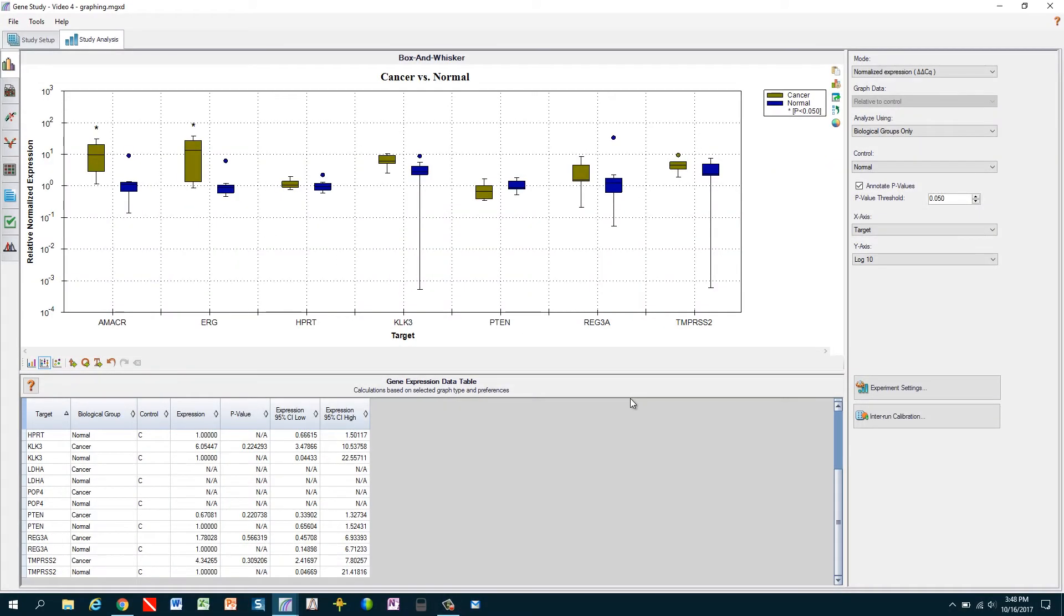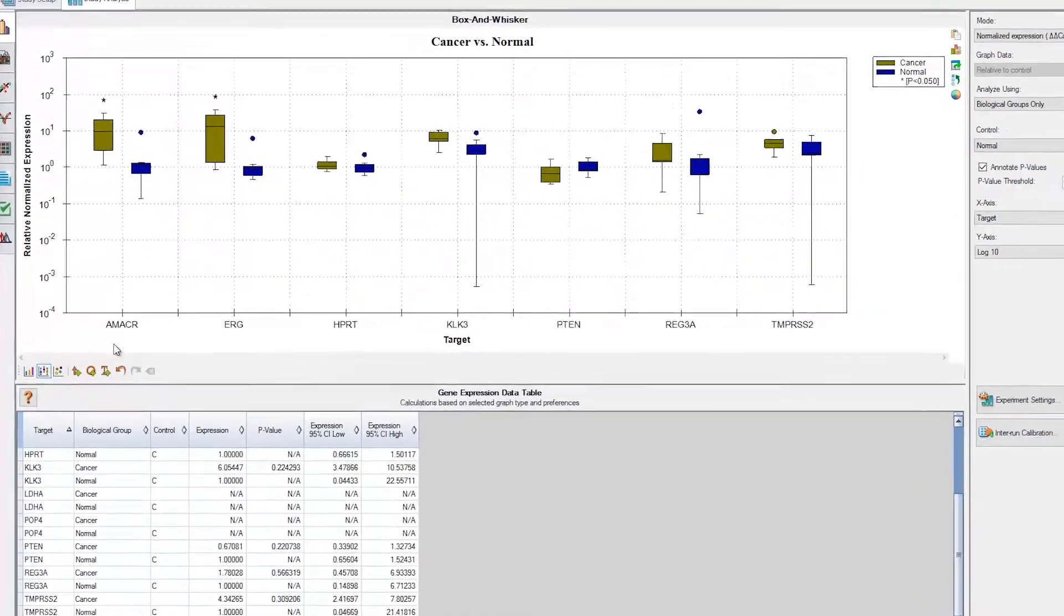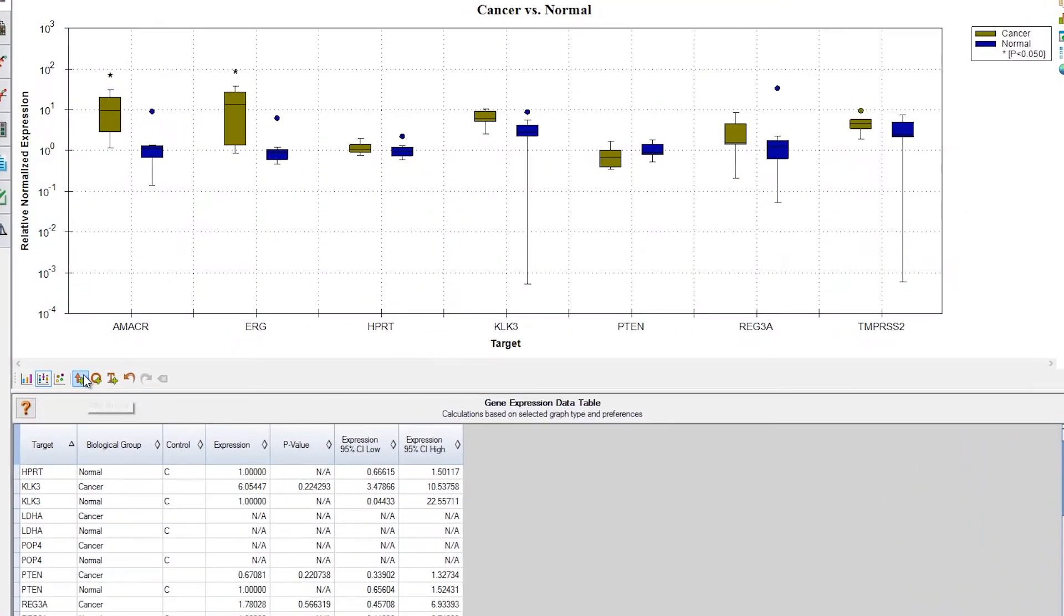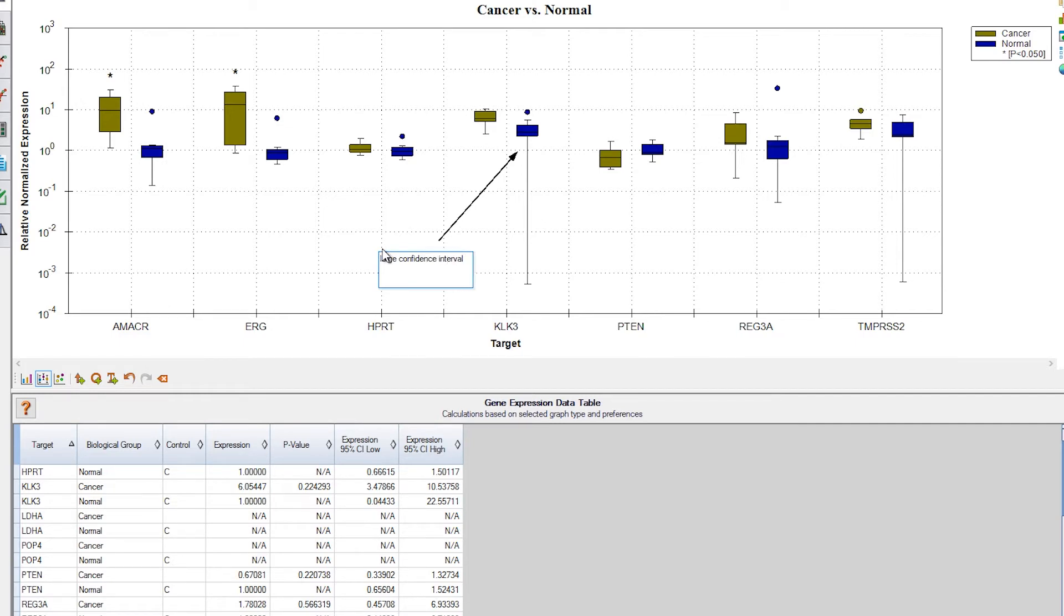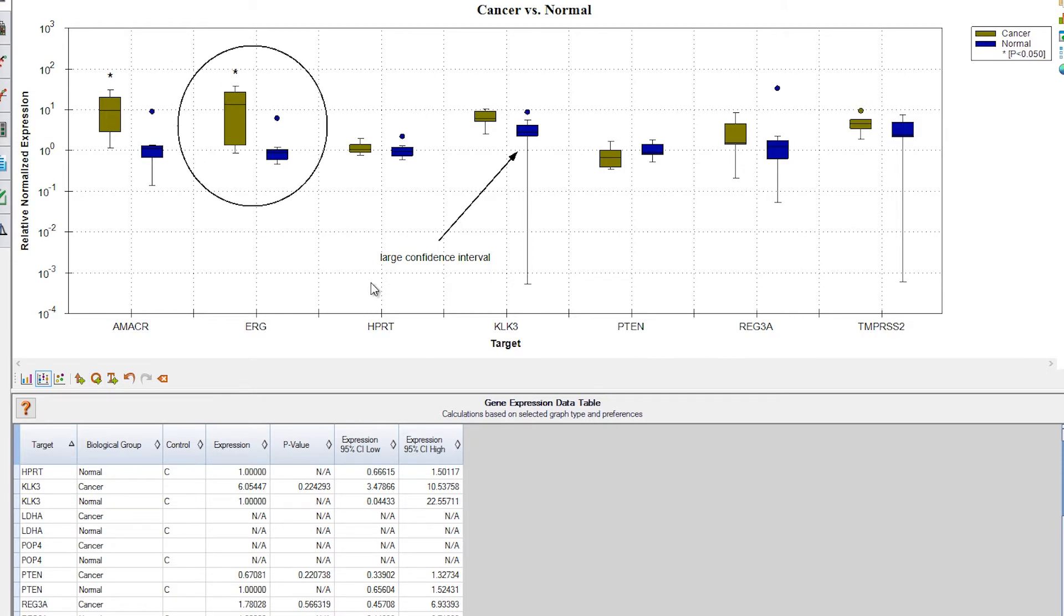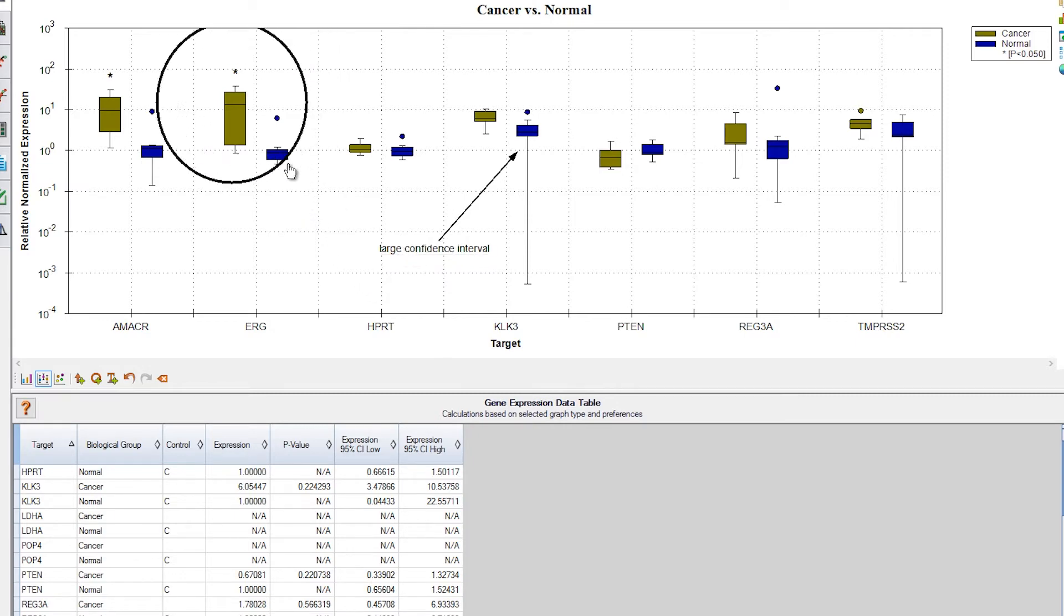Now let's say that we want to call out specific data and add text. Click the arrow button. Then just click and drag to point to data. Let's focus on this target with a wide confidence interval. And we'll add text to explain what we're pointing to. Finally, let's just circle the ERG gene. We can move any annotation element to get the positioning just right by clicking and dragging that element to the ideal location.